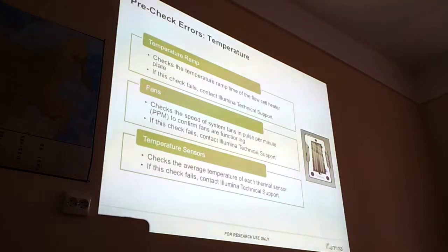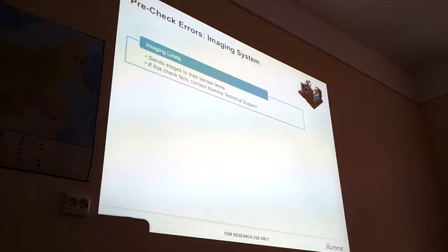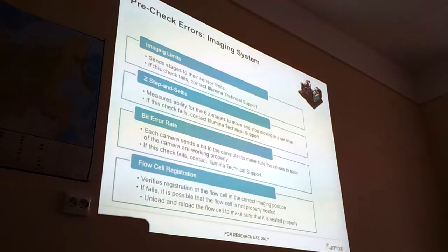The same with the fans for the cooling and with temperature sensors. Imaging system. Yeah. You have to call for help if this is failing. Call tech support. Obviously, you shouldn't try to fix it.